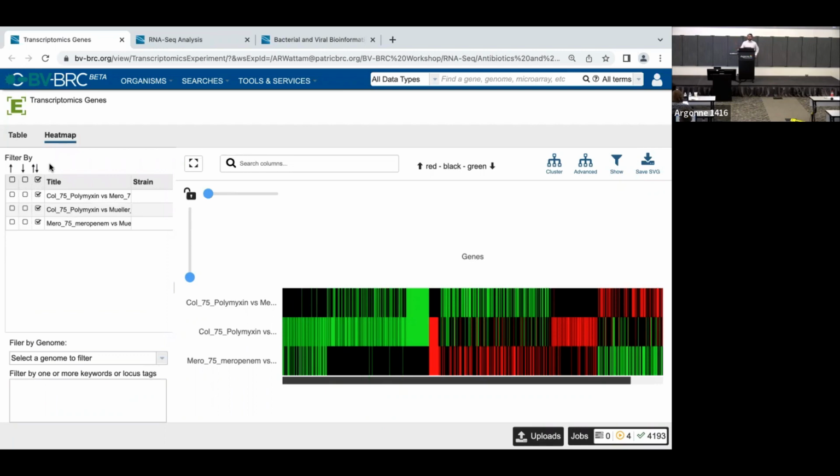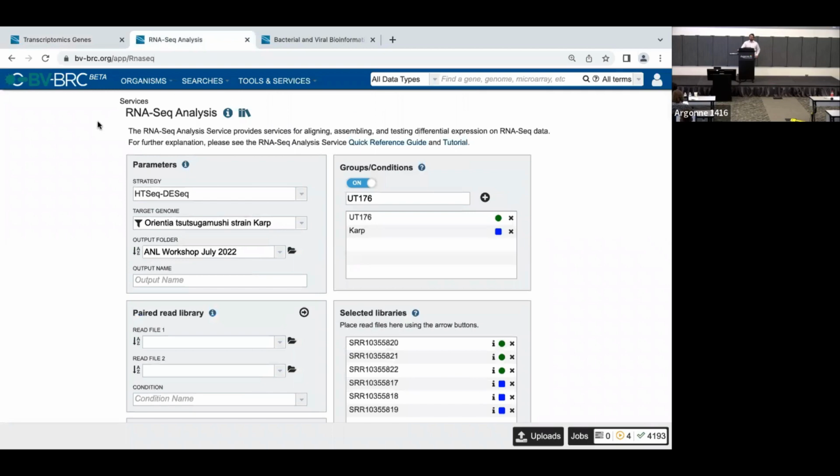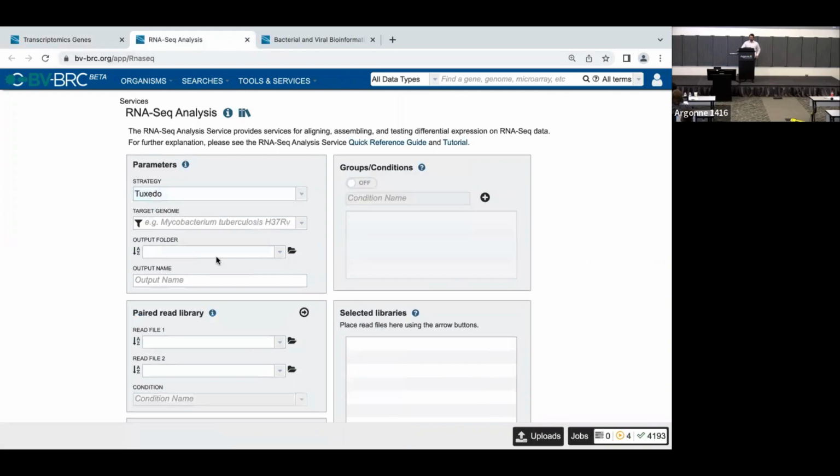There is another question here. Somebody who joined at the beginning of the session is asking, can you show the input page one more time? The person wants to use HiSat2 with 2 conditions and 2 replicates. So how would somebody do that? Sure, I can go ahead and do an example of filling that out. Sorry it took so long to get to that question.